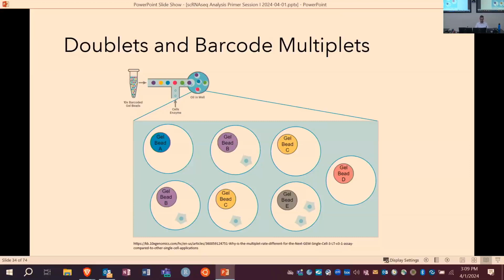If each of those droplets gets a cell encapsulated into it, it will appear downstream like there was a doublet, because if those 2 are different cells, we can't distinguish those 2 droplets from each other. That doesn't occur super often, but it is another mechanism for how doublets can happen.